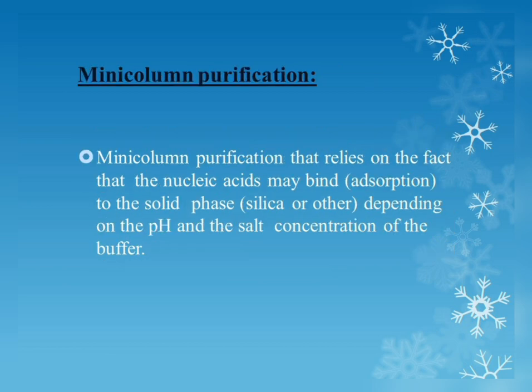Next, the third step, mini column purification. Mini column purification relies on the fact that nucleic acids may bind to a solid phase, like silica, depending on the pH and the salt concentration of the buffer.